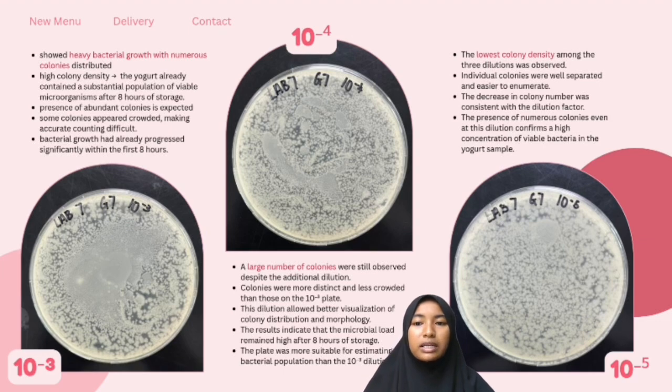Individual colonies were clearly separated and easier to count. Despite the dilution, a considerable number of colonies were still present, indicating that the original yogurt sample had a high bacterial load.